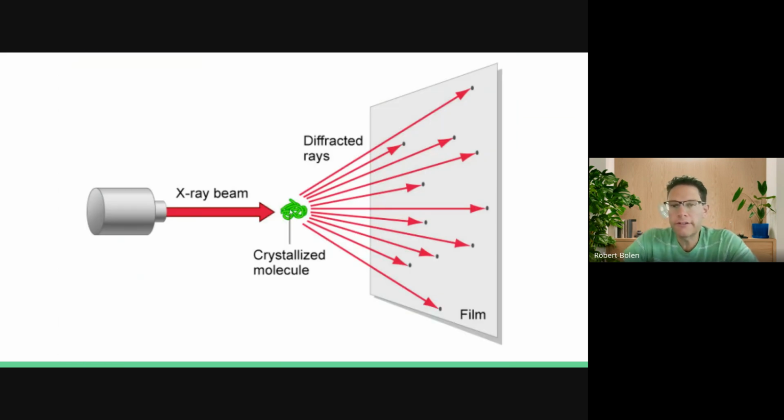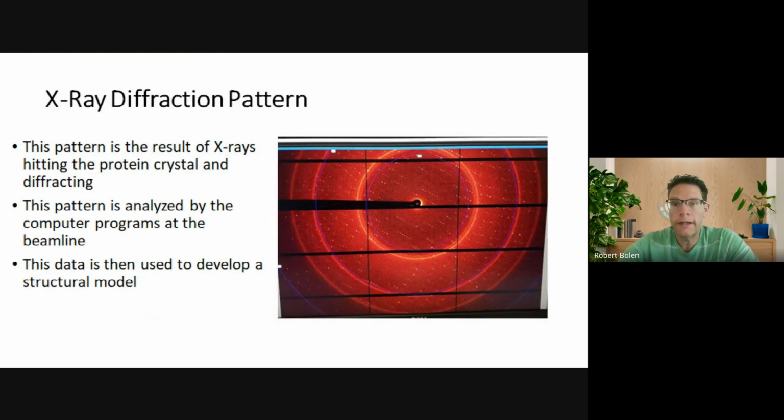The X-rays hit the crystal, it diffracts, and we get these dots on this film. Now, the film is actually on a detector, a computer detector, that will then take those dots and transform it into a 3D structure for us, okay? What we want to see is a nice diffraction pattern with nice concentric dots. We want to see that there's a pattern that forms, there's uniformity there.